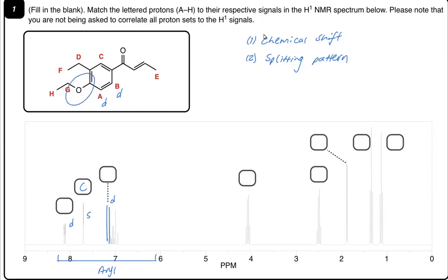What I'm going to acknowledge is that the oxygen is attached to the benzene ring, and that's a resonance donating group. Now, because it's resonance donating, what I need to annotate is that it's going to create negativity ortho to it and para to it. This is what we talked about earlier. The donating group causes negativity to be ortho and para relative to it. Then the C double bond O is a resonance withdrawing group. As it withdraws out of the ring, it would put positivity ortho and para to it. Now you'll notice that at position B, it's receiving that positivity, whereas A is receiving the negativity.